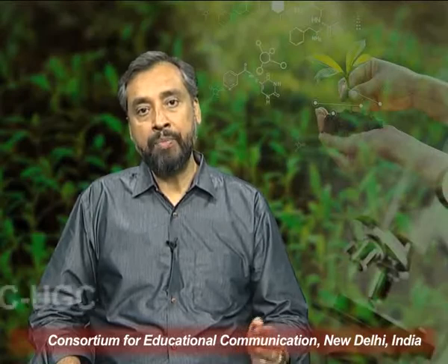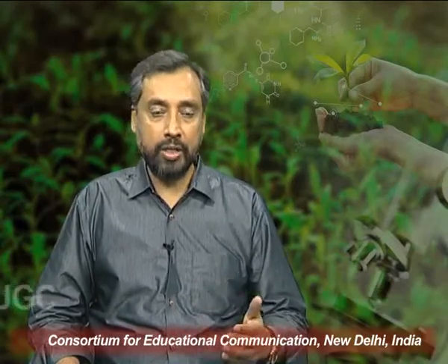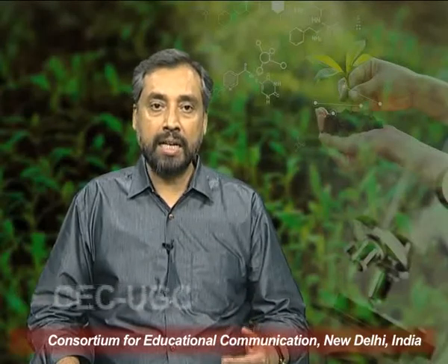The beam deflectors attract or repel the beam according to signals sent by the deflector circuitry. As the electron beam sweeps rapidly over the specimen, molecules in the specimen get excited to higher energy level and they start emitting secondary electrons which are then used to form an image of specimen surface.